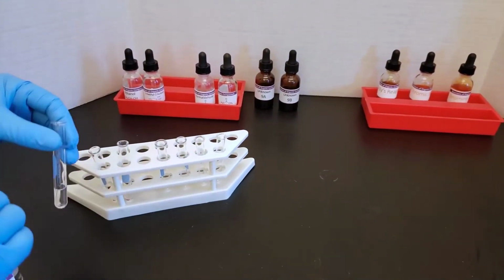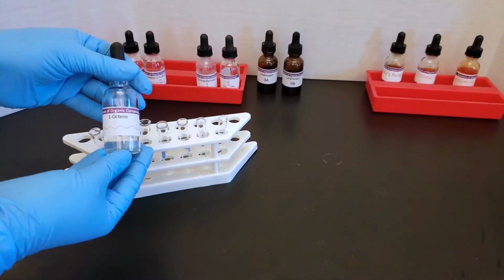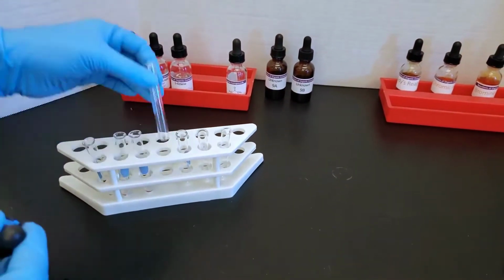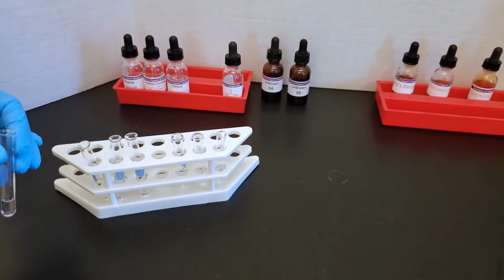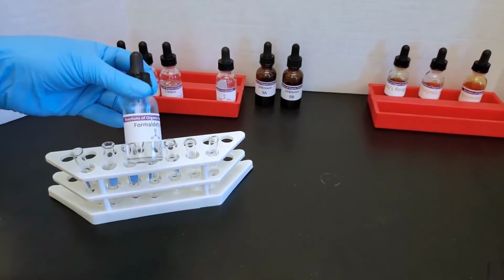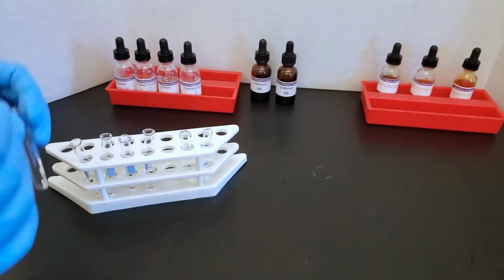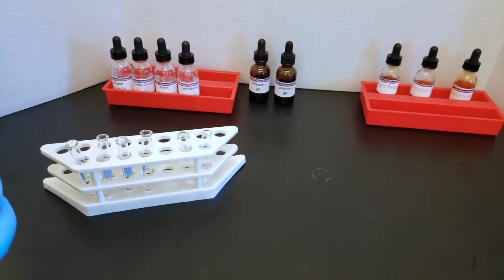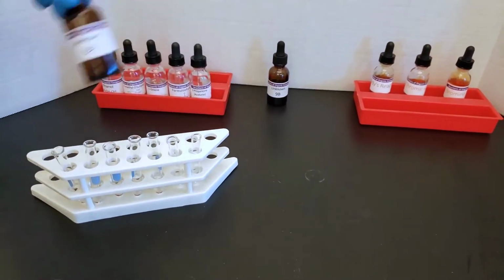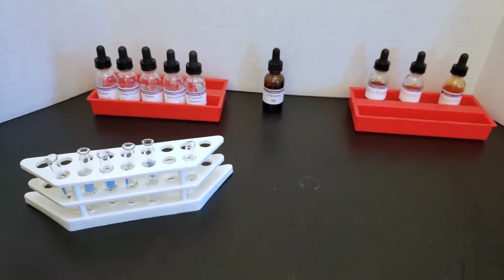Here we are quickly loading some tubes with about a milliliter of each thing. What we have in tube 1 is ethanol. In tube 2, 2-methyl-2-butanol. In tube 3, 1-octene. In tube 4, formaldehyde. Tube 5, we have acetone or 2-propanone. In our last two tubes, we're going to test unknown 9A and unknown 9B.